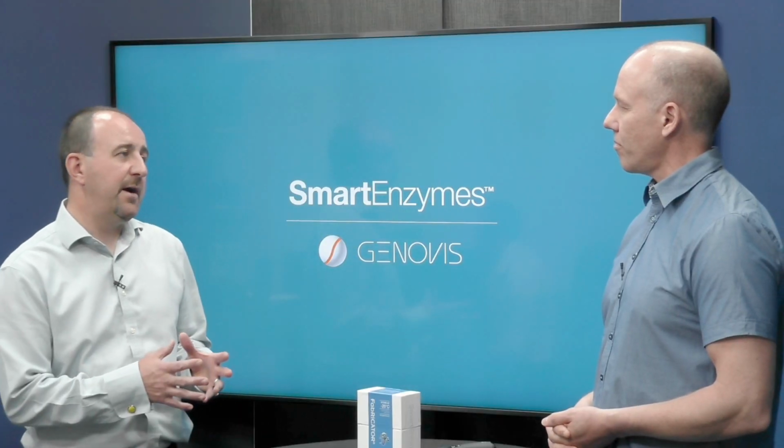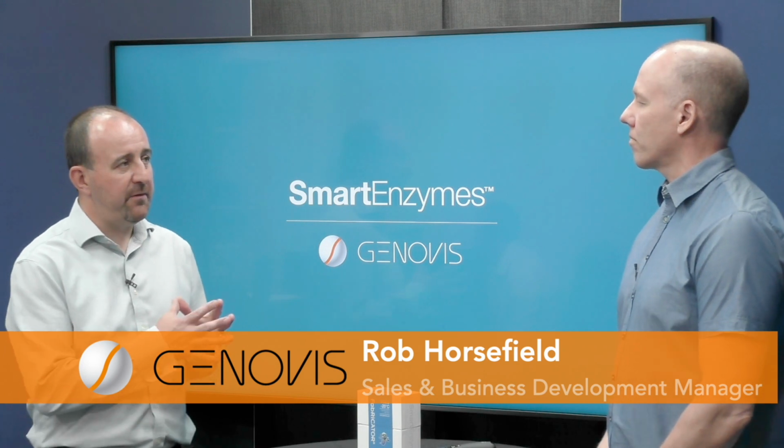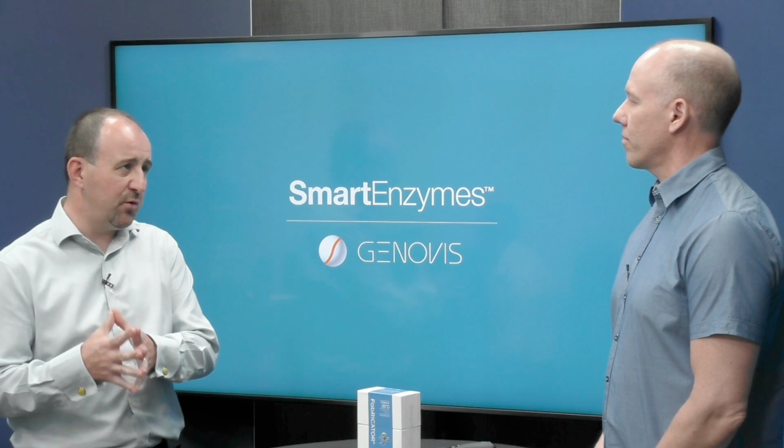And then the last question that I had was around QC and whether you could envision this FabRICATOR MagIC being useful in the QC environment on the automation side. Yeah, definitely. From a broader perspective, I definitely see MS going into QC in general, and that needs to be supported by solid sample prep workflows.